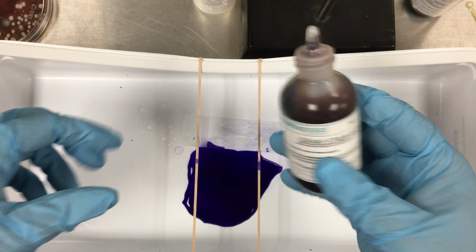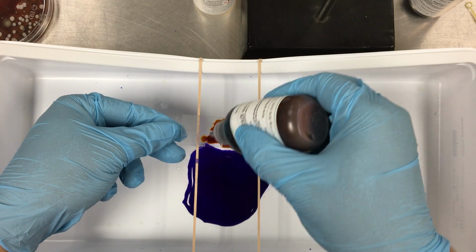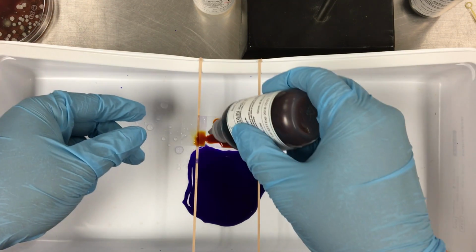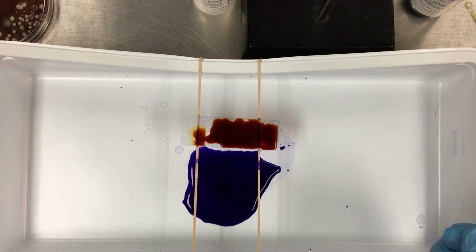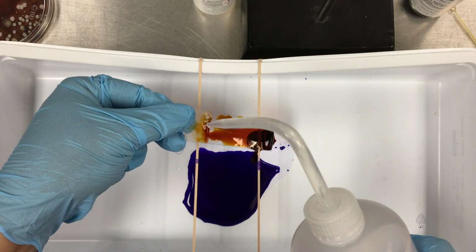Next, we apply the iodine, and we do the exact same thing with the iodine. Cover the whole slide where the sample is. Leave that on for 60 seconds. And after 60 seconds, we will rinse it off.